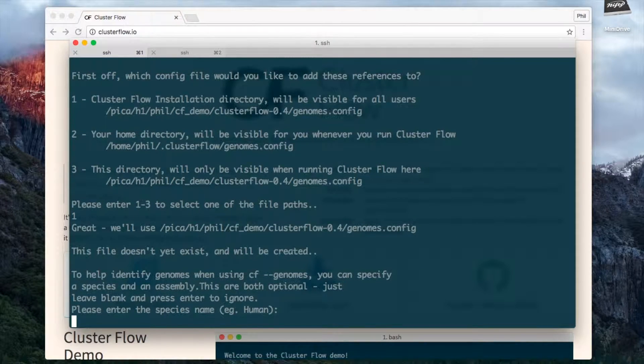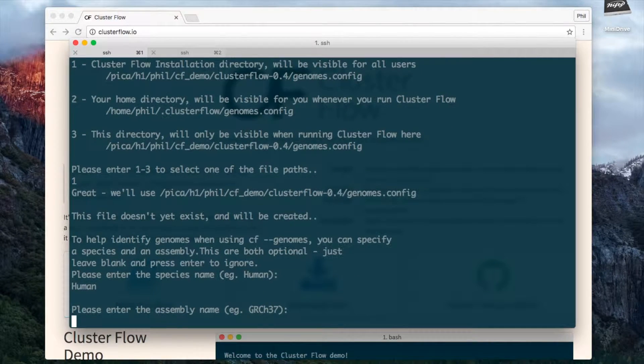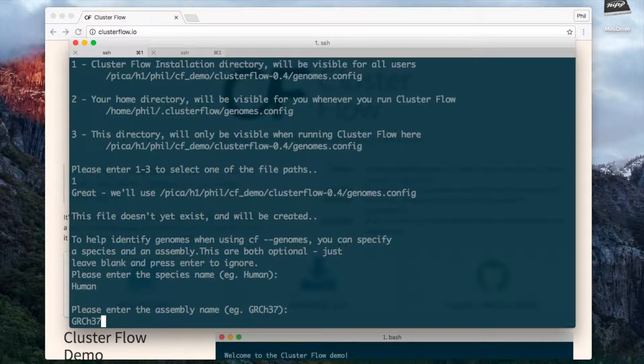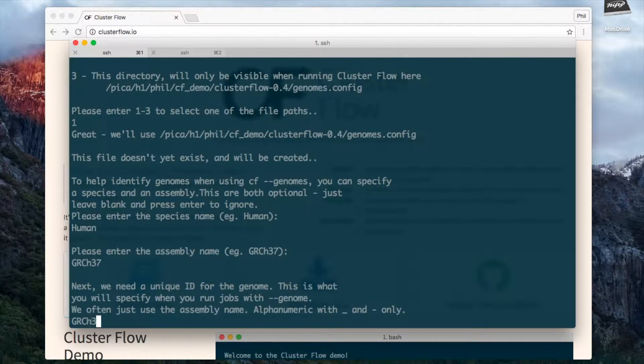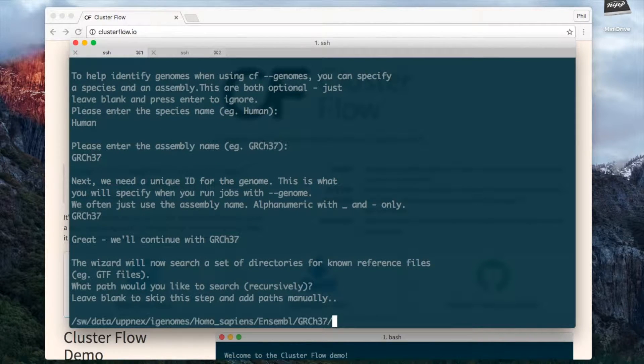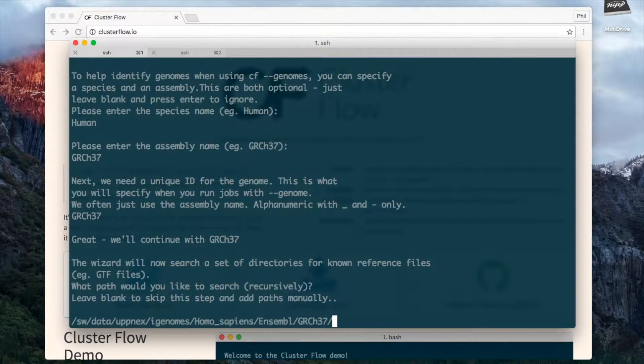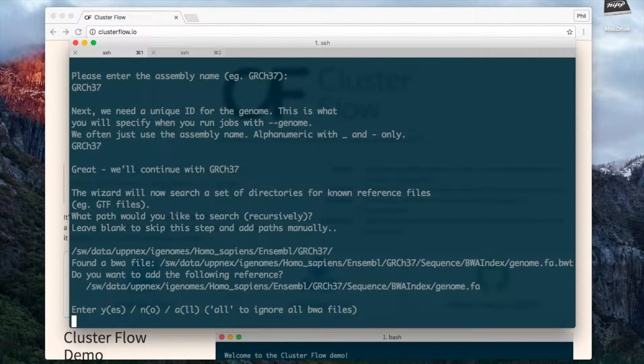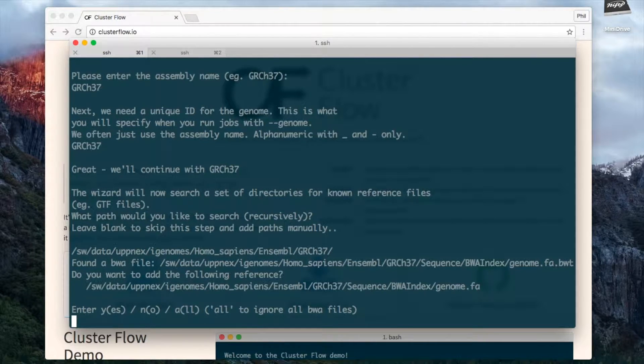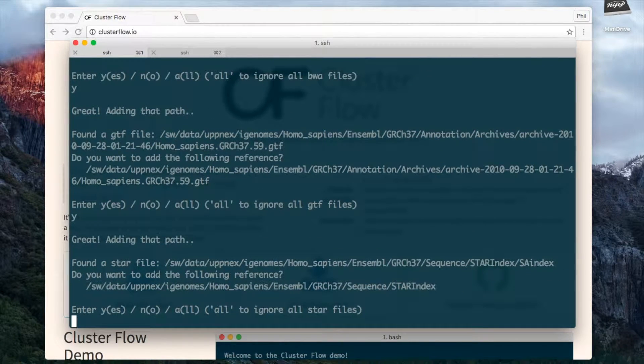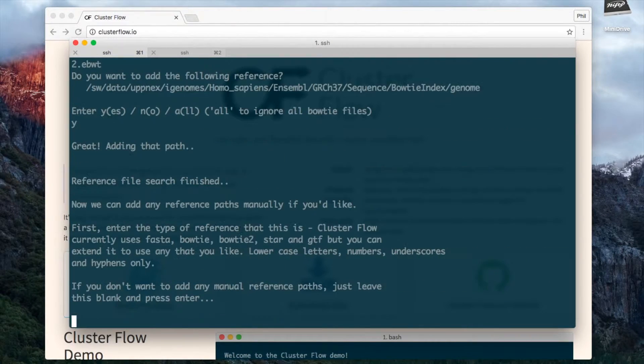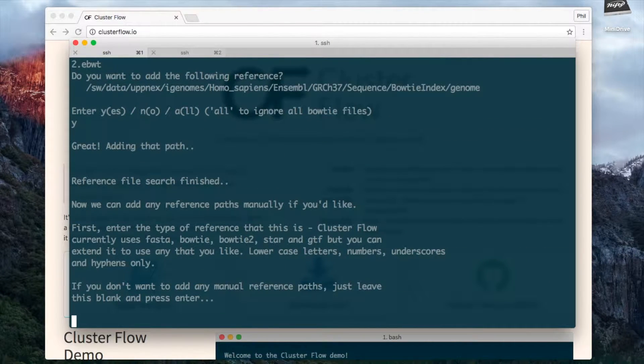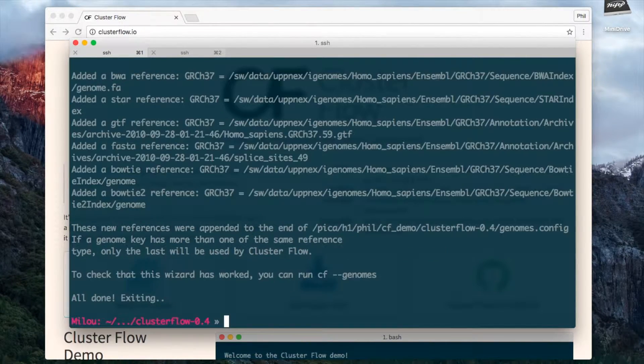I'm going to add the human reference genome here, so I'm going to follow these questions and put in the things that it suggests and I'm going to set the ID to be GRCh37 because that's easy to remember. Now I'm going to give it a path to search where I have a whole range of different reference genomes here and it's going to search through these and hopefully look for things that it recognizes automatically. So it's found an index for bwa so I'm going to say yes, it's found a gtf file so I'm going to say yes, the STAR reference and the fasta file, bowtie2, bowtie1, and I'm not going to add any manually now but you can add further ones manually as well.